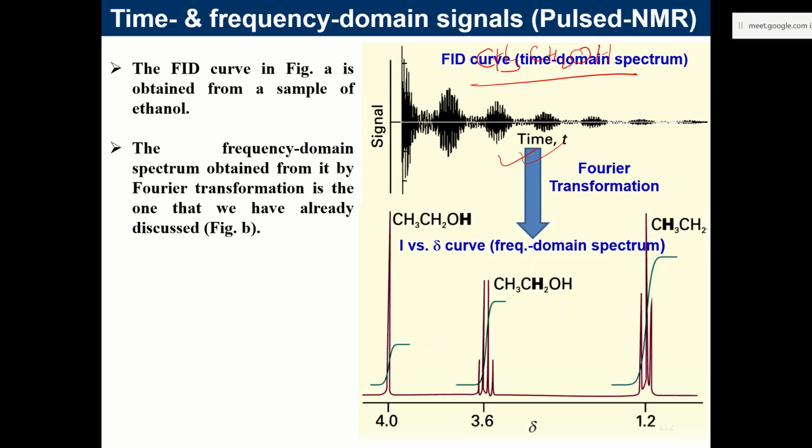After Fourier transformation, you get it in terms of frequency. The difference of frequency gives you the chemical shift, so it is still a frequency domain thing. This is how the spectrum is obtained, giving the example of ethanol, which is the simplest one that we can think of for this discussion. This is the pulse profile, and from that pulse profile we are able to obtain the NMR spectrum, like this.